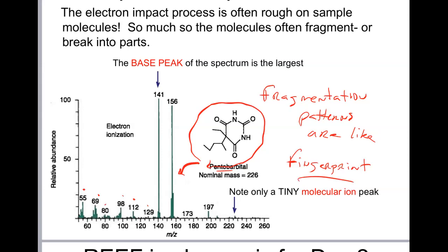So, let's just say that I'm really into this GCMS thing, and I do analysis of thousands of different compounds. I test out many, many different compounds on my mass spectrometer after GC, and I record the resultant electron impact ionization spectra. Couldn't I build a library of all my spectra that I saw? And then perhaps I could run an unknown sample and on my computer record a mass spectrum. And if I got really good at this and was proficient at computer software development, I could even develop a library software package where I could compare the mass spectrum that I obtained in an experiment with my library.